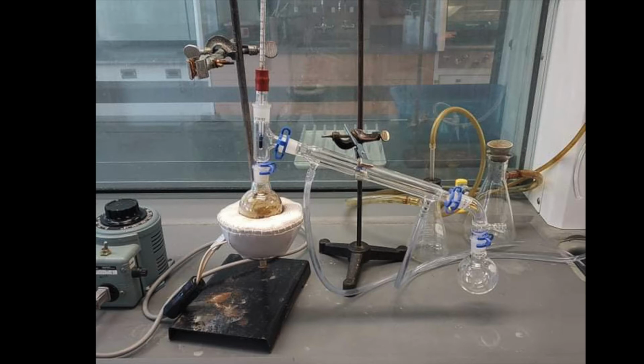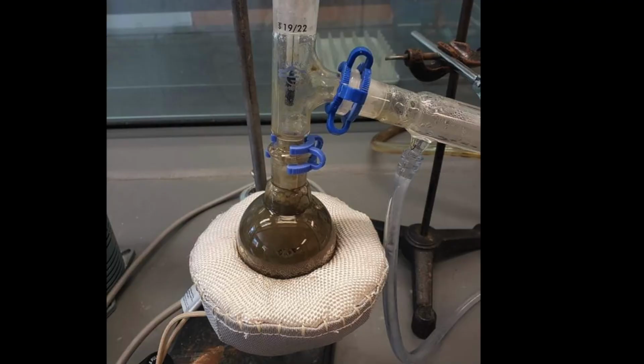Remember that the heating mantle gets plugged into the variac and the variac gets plugged into the wall. That is how we are going to control the heating. If you have not done so already, you can turn on the water for the water-jacketed condenser so that we can start cooling that down. Continue distilling until you've collected 20 to 30 milliliters of your distillate. If your spice starts to boil up and froth into the condenser, then you should turn the heat down.